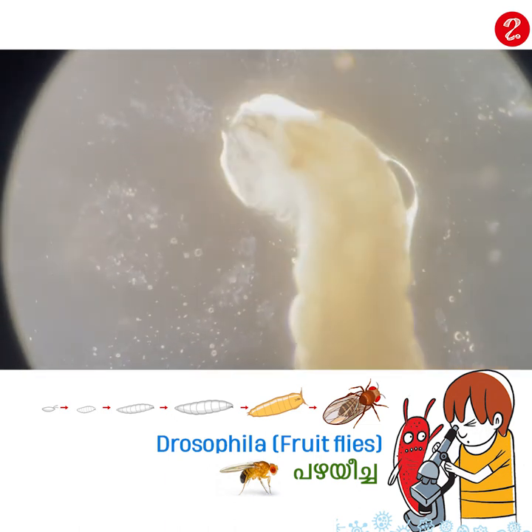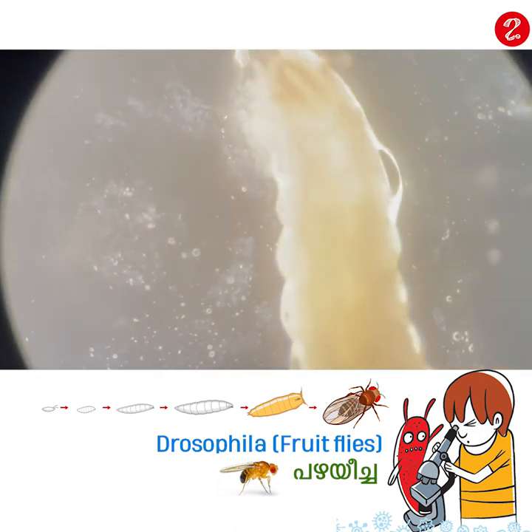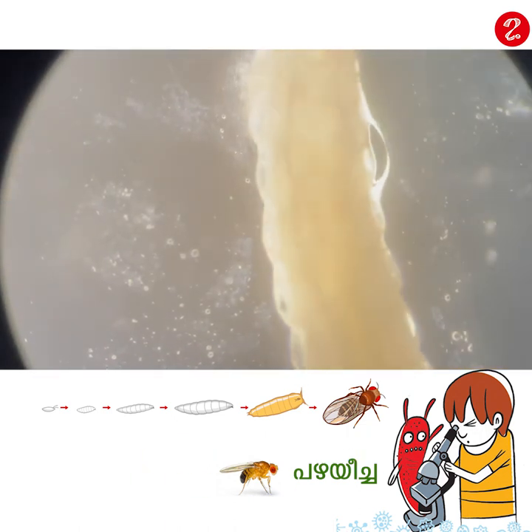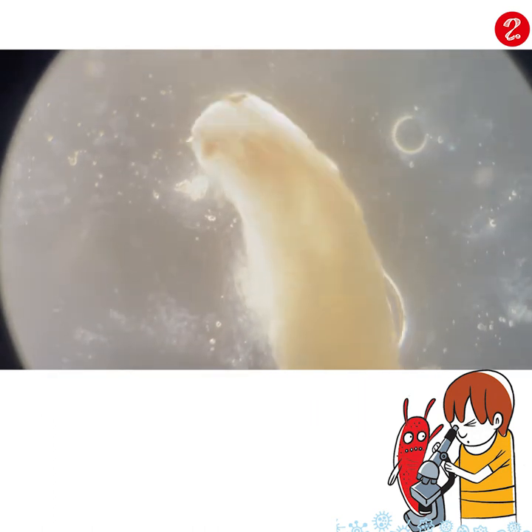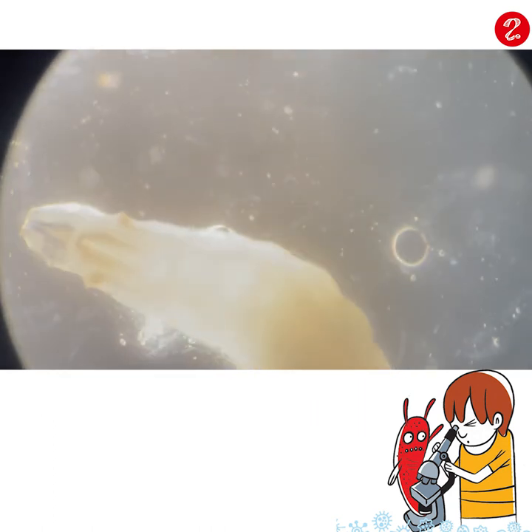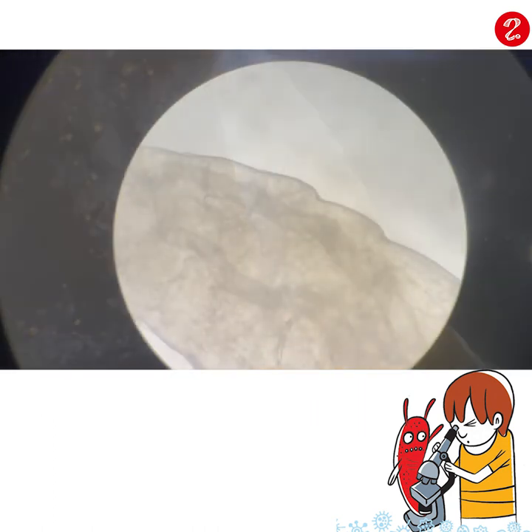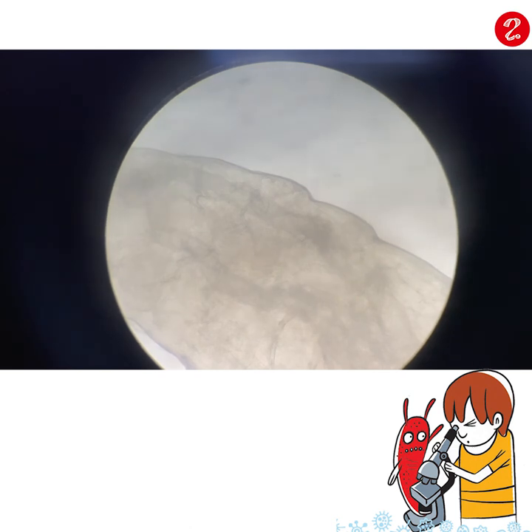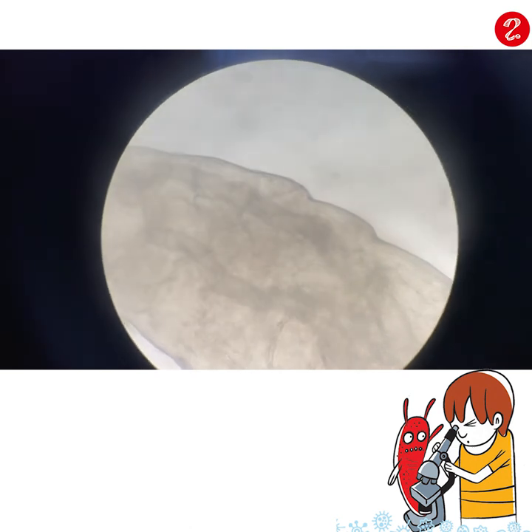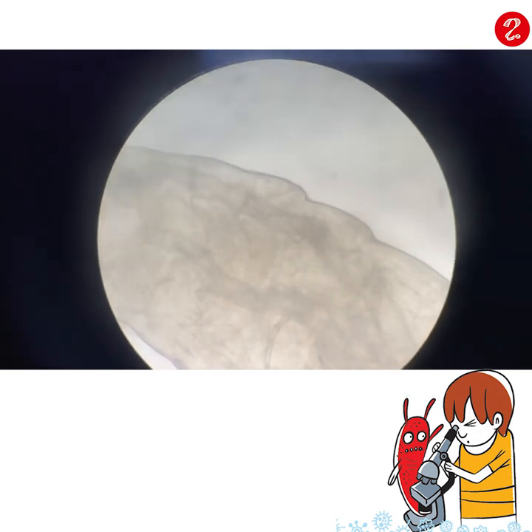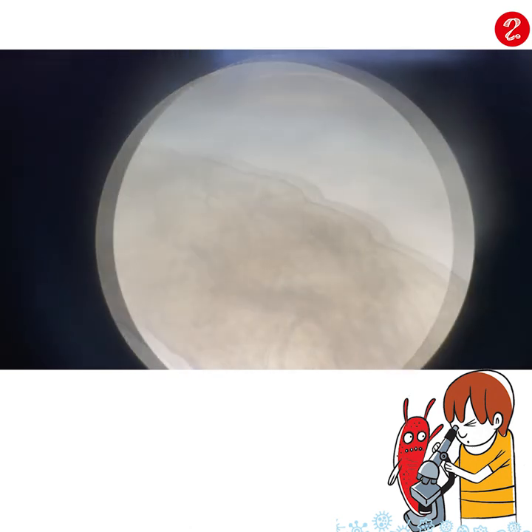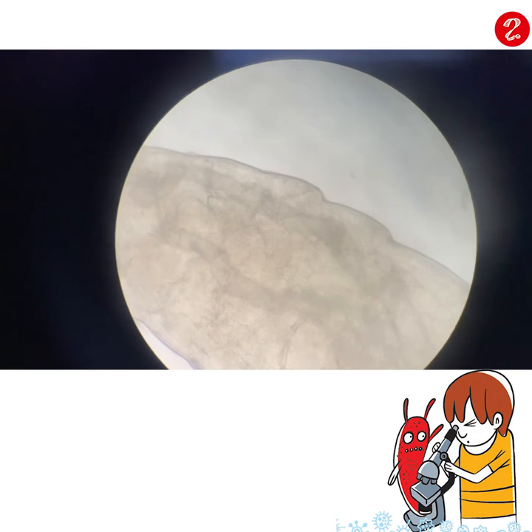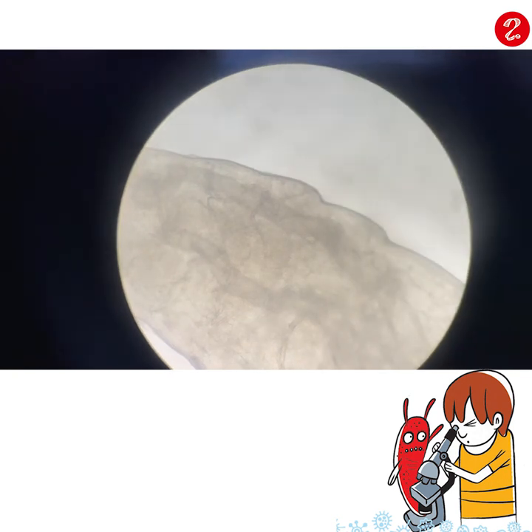We are going to squash it. Now we are going to look at the spiracles. In this life stage, the insects take in air. This is the tracheal system.